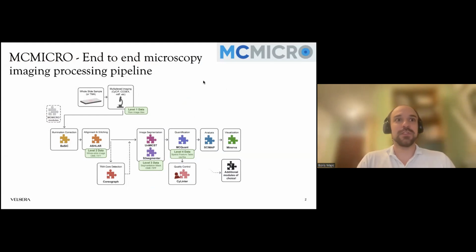Now, before I demonstrate how to use this workflow on CGC, I will briefly go through each of the steps that are covered in this workflow.